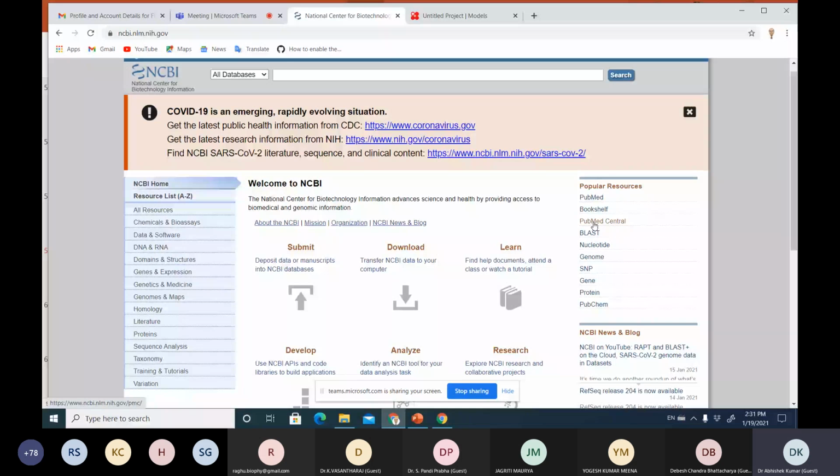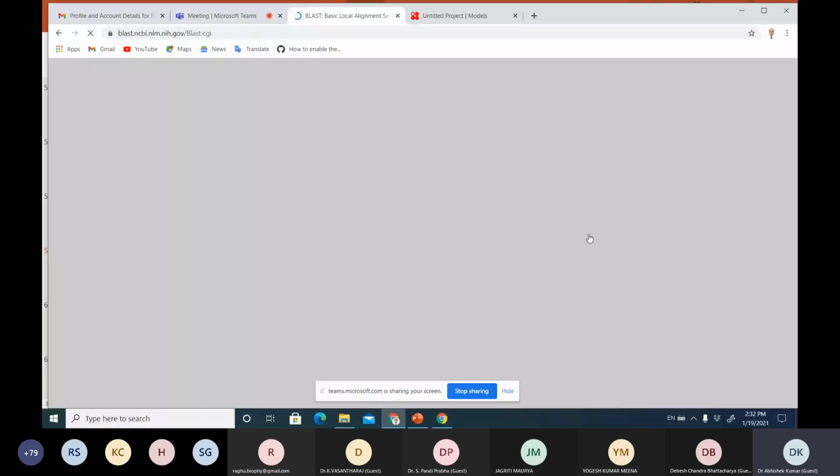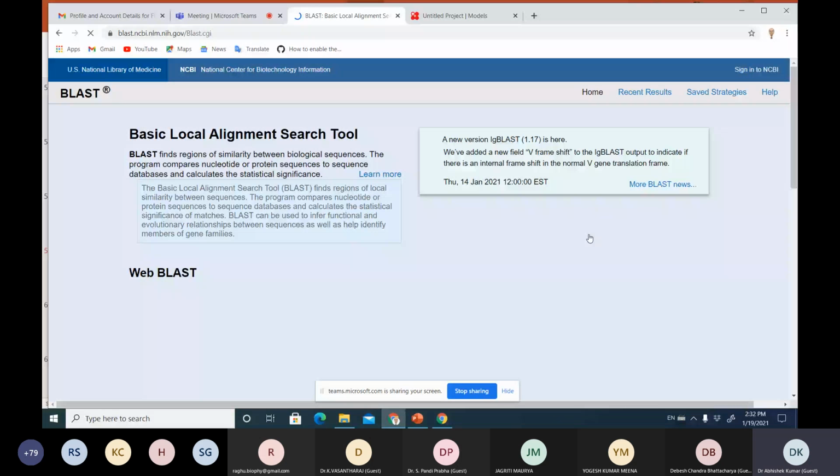So we are going to use Blast, as we promised. If you are from computer science, Blast is a web-based tool, and it is also available for downloading locally, putting on your own server or your own laptop, and you can use it as standalone software. Assuming some people are at least from an IT background, we will have some look.